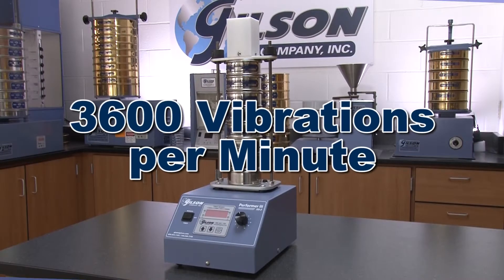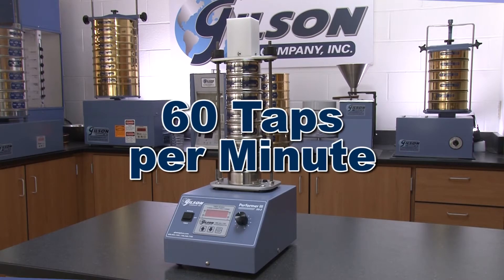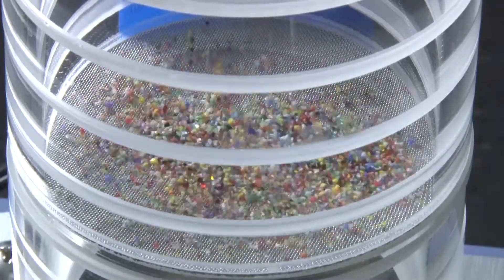The 3600 vibrations per minute vibratory action of the SS3 3-inch sieve shaker, when combined with the 60 taps per minute tapping action, re-orients and re-distributes the sample for optimal use of the sieve mesh surfaces.